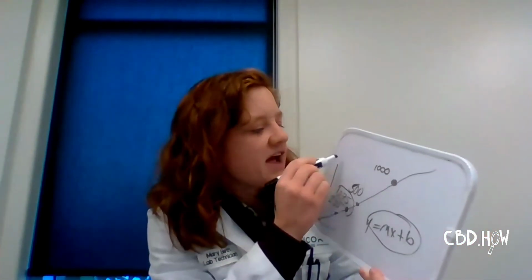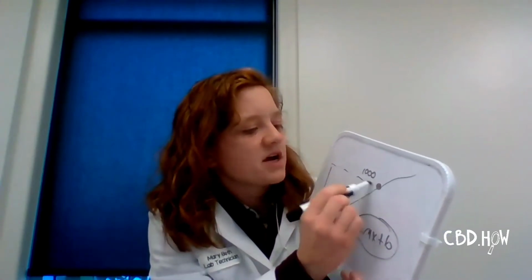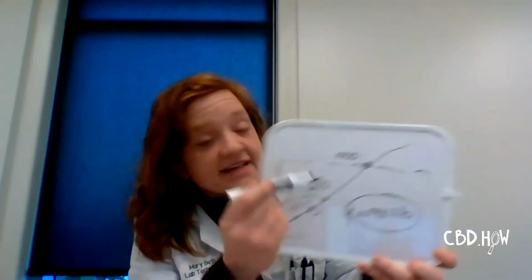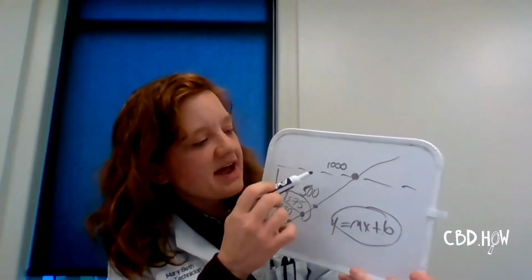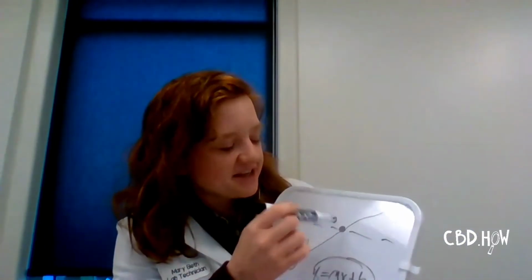So in terms of having all of the solvents on the same concentration level, it has a lot to do with how the standards that we use are manufactured. But once we buy that calibration standard, which is another reason why not everyone can just whip up a testing lab at home, there's a lot of funding that goes into buying those standards and making sure that your instruments have been properly calibrated.